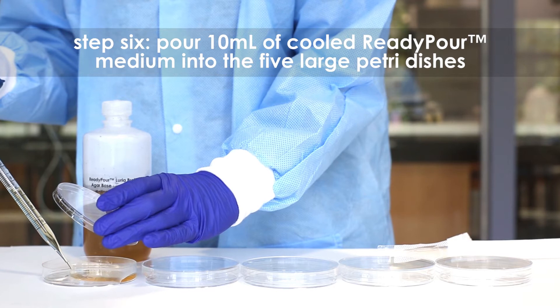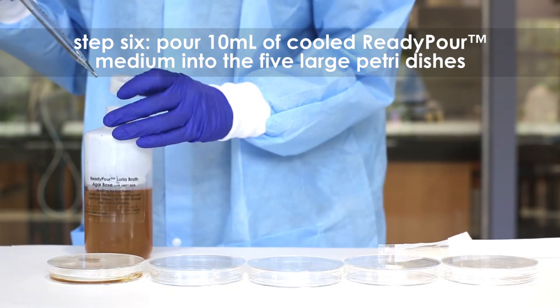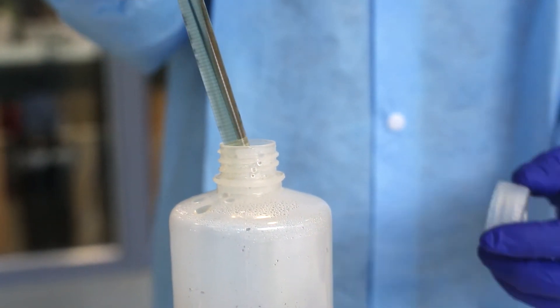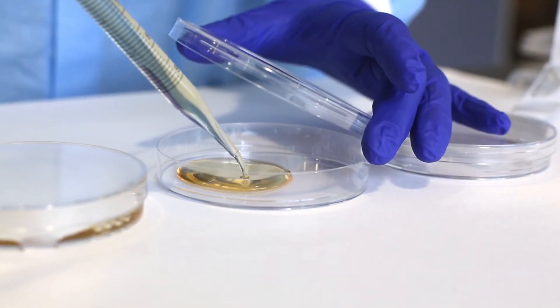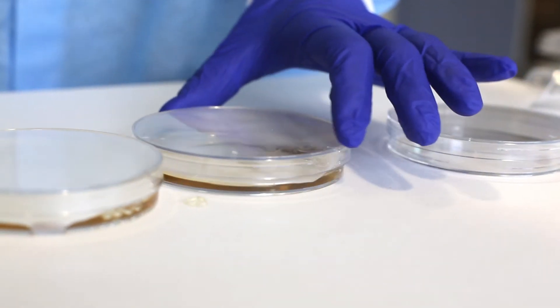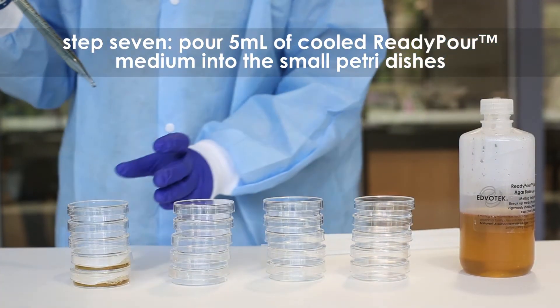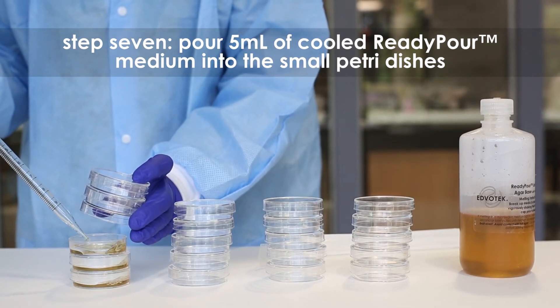Step 6: Pour 10 ml of the cooled ready-pour medium into each of the five large petri dishes using a sterile 10 ml pipette and pipette pump. Step 7: Using a fresh sterile 10 ml pipette, pour 5 ml of the medium into small petri plates. These are the control plates.